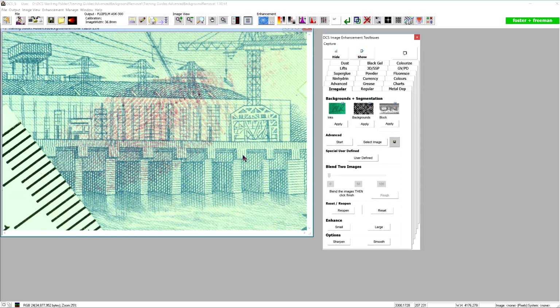However, we must also consider the fingerprint itself. In this second image, the fingerprint must be black, otherwise this too will also be removed. So in summary, we are looking for an image where the background printing is white but the fingerprint is black. Click Start to begin.